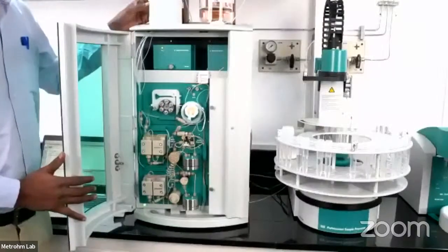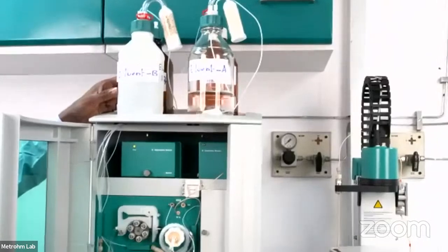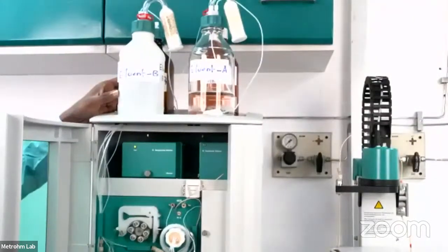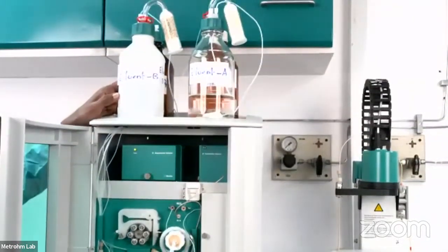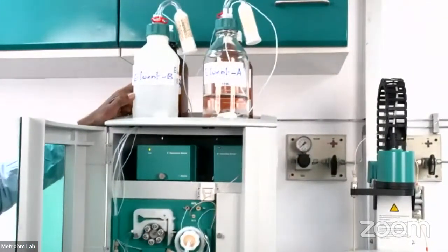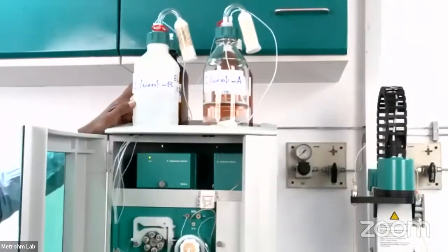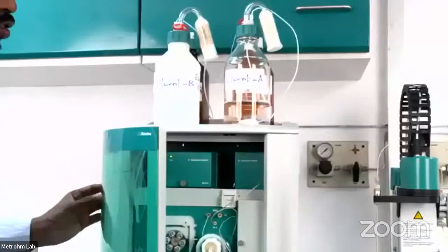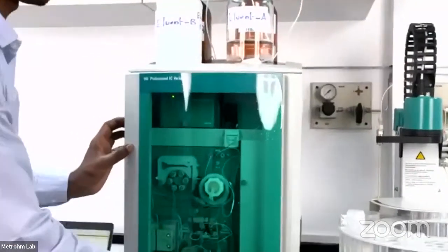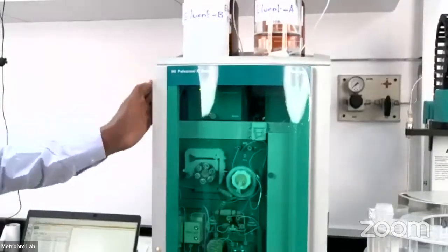So it starts from the eluent, the mobile phase. It is normally ionic in nature. For anion analysis, we can use sodium carbonate and sodium bicarbonate eluent. In case of cation, we can use diluted nitric acid. This is generally what we use for our anion and cation applications. The 940 instrument is capable of analyzing anion and cation in parallel. So this is a parallel instrument.